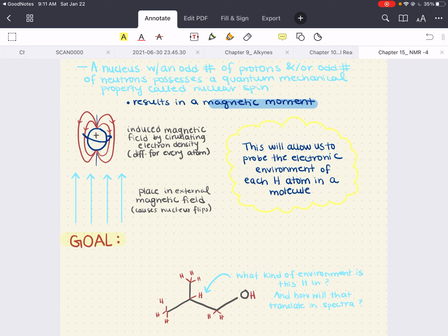So essentially, at its core, this interaction between the magnetic moment of the nuclei and an external magnetic field is in short detected by NMR to obtain the spectra we get. It is simply an interaction between the nuclei's own magnetic field and the external magnetic field that it's put in. This interaction is the reason we see and observe our NMR spectra. That is what is detected.